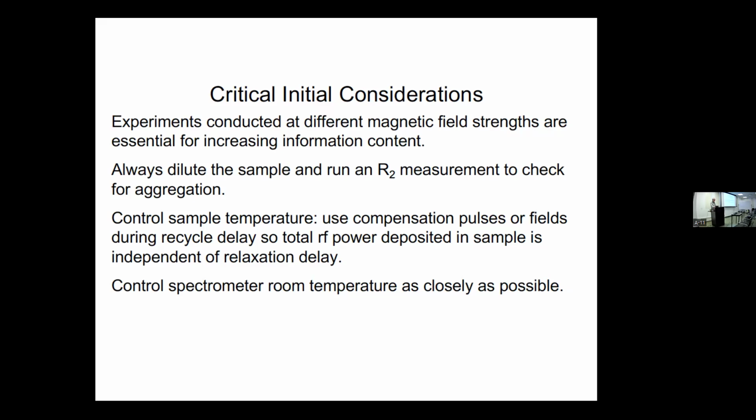The solution probes don't use quarter wave matching? It's tuned and matched to 50 ohms, but I actually don't know what that means relative to quarter waves, et cetera. We have to ask Ann these things. Every time I hear a solid state NMR person talk about tuning, they're talking about quarter waves, half waves. But you talk to a solution person and you say, I tuned and matched until I got a minimum.